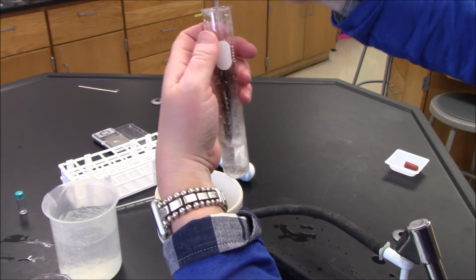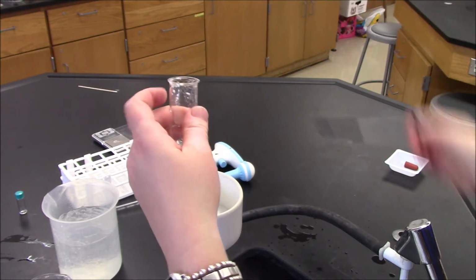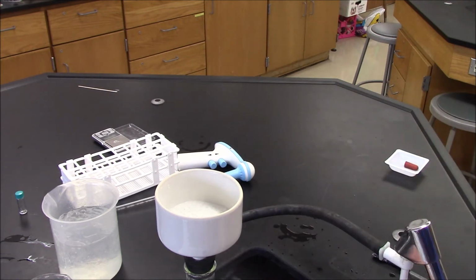Try and get my percent yield as much as I can, but it's not going to be perfect. Okay, one last rinse.